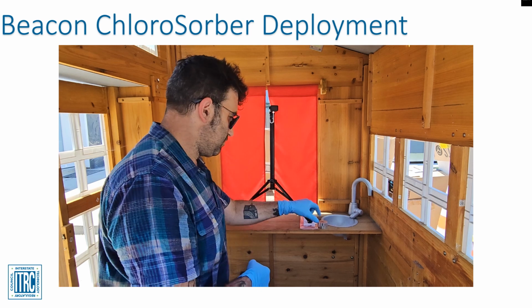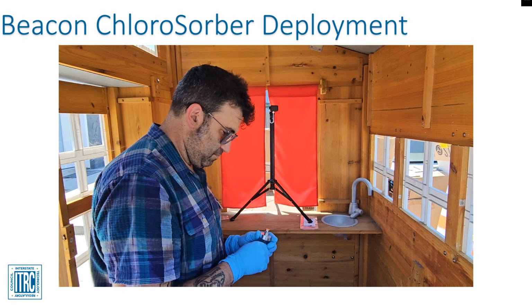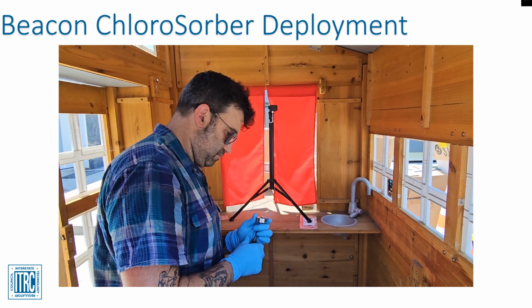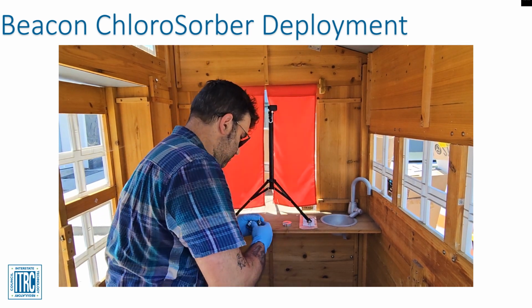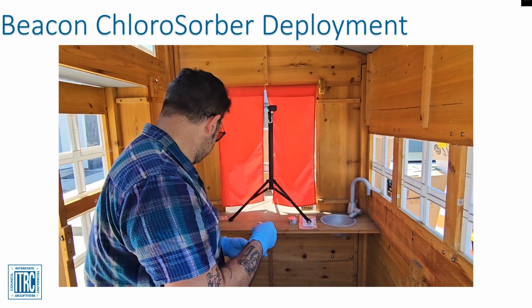The top of the sampler is then inserted and pushed into the plastic loop fitting until it is fully secured. Next, the sampler is secured to the predetermined location using string. You can also use wire or fishing line or a tripod. The device is deployed to the predetermined sampling location. The samplers are then left to collect for an exposure period of several days to weeks. The desired exposure time should be determined prior to the sampling event.